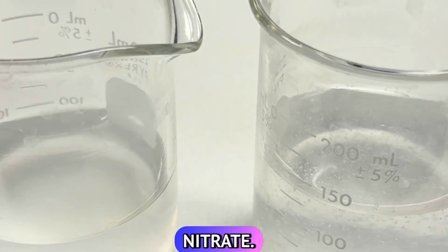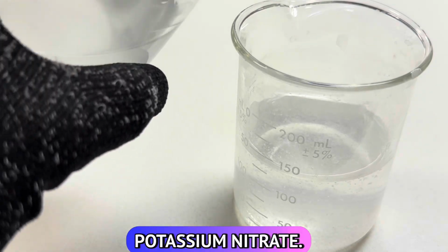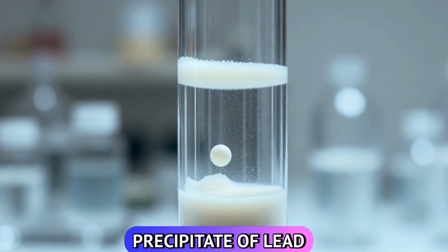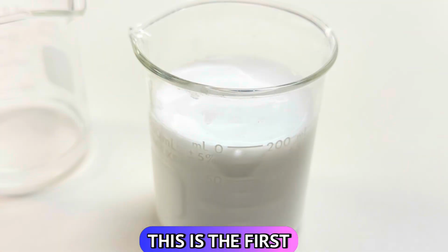Begin with the double displacement reaction by adding your aqueous solution of potassium hydroxide to your aqueous solution of lead 2 nitrate. This will create lead hydroxide and potassium nitrate. You can see that instant milky precipitate of lead hydroxide. This is the first step.